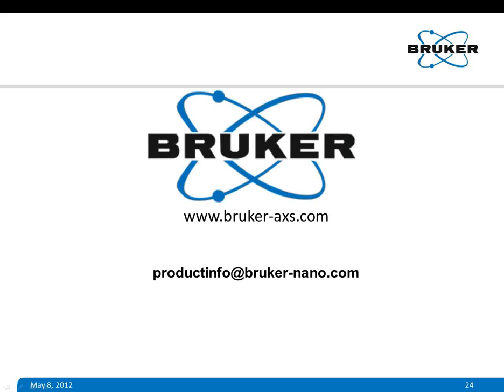But at present we do not have this. We cannot really simulate high temperature for tribocorrosion measurements in our system, but this is a limited case. It is a special case, and most of the tribocorrosion cases in question are related to aqueous environments, meaning that they require some kind of water-based solutions where temperature doesn't go more than probably 80 degrees Celsius.